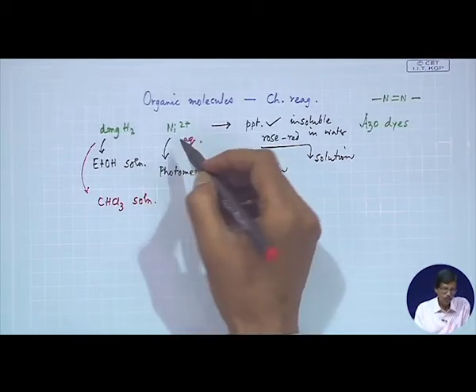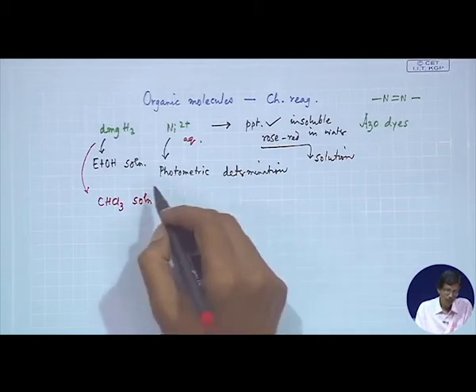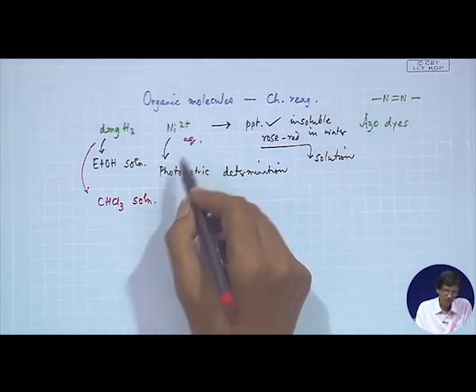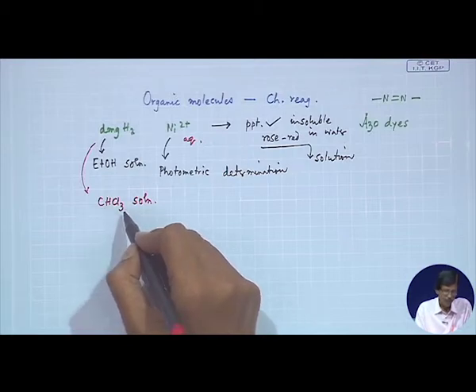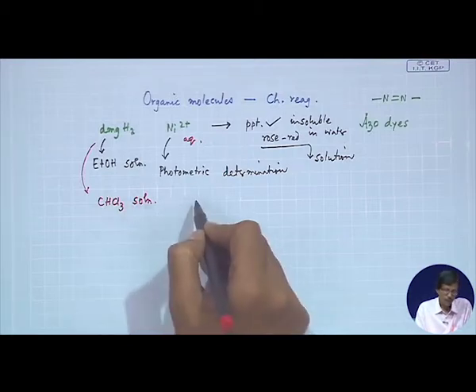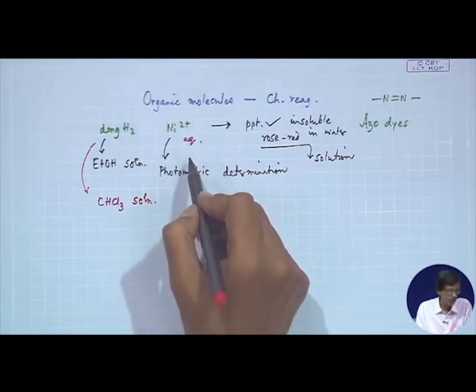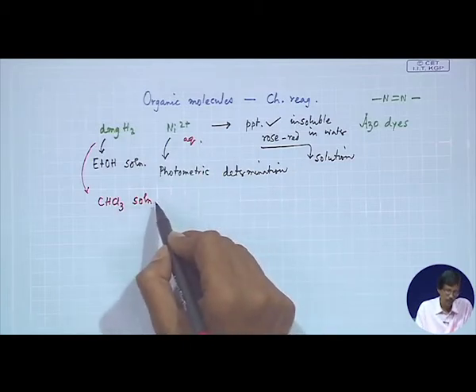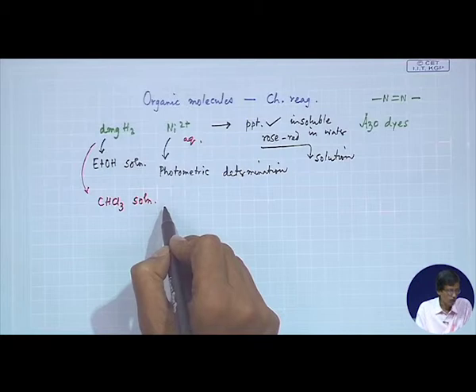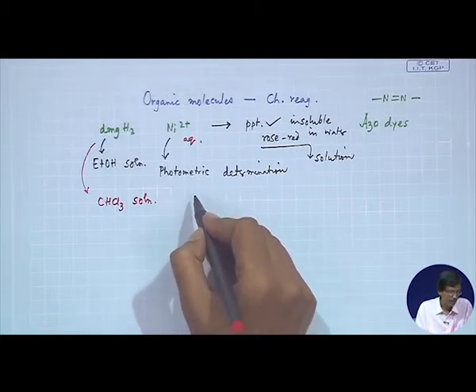As we all know, the aqueous medium, the water medium, and this CHCl3 medium can form two separate layers. So, the aqueous layer of this nickel 2+ can be extracted into a chloroform solution of DMGH, which is a chelating reagent.